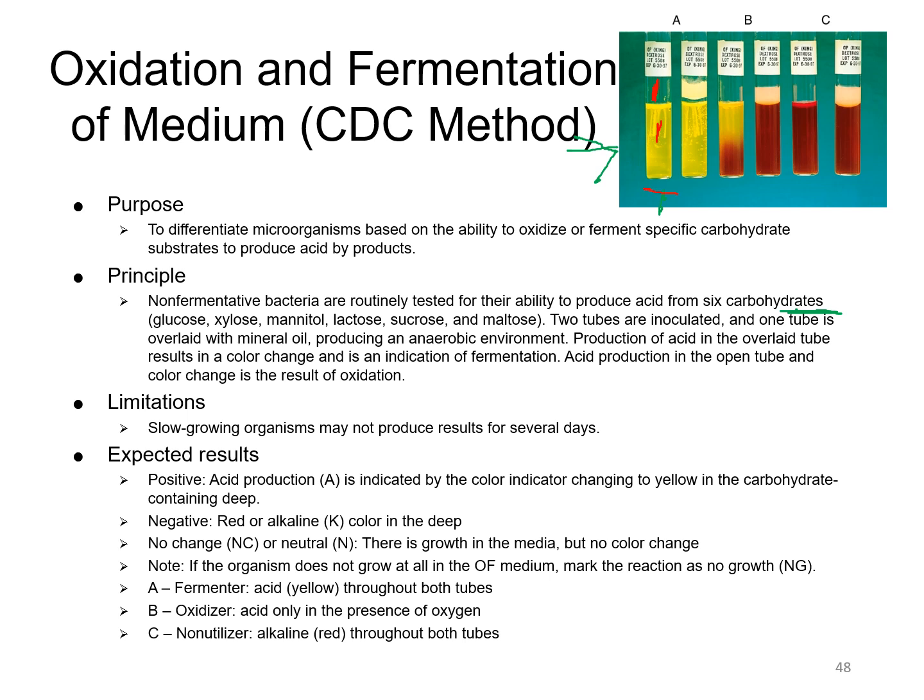You can see that these 2 tubes here, both of them are labeled A, where you have one tube that has no oil laid on top, and then you have one that does have a little oil layer on top.